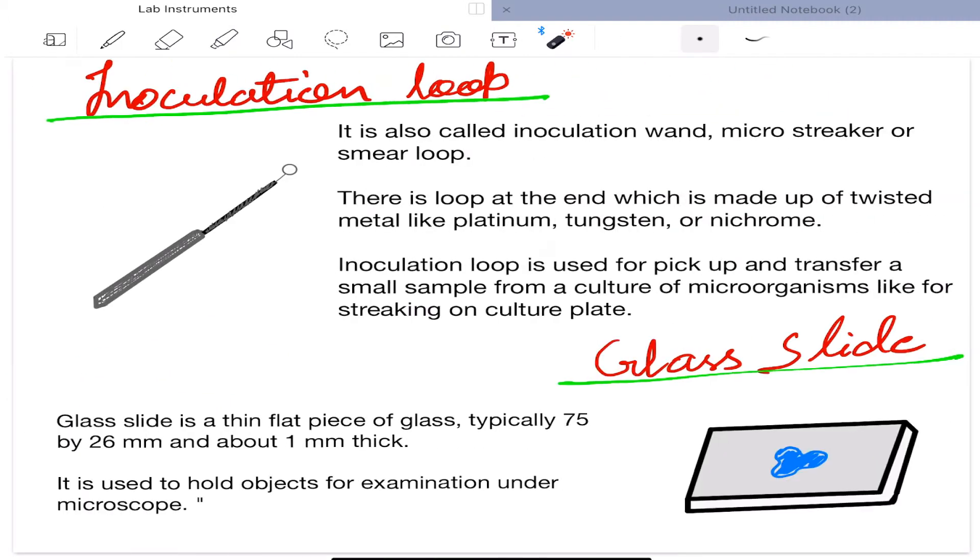Next is inoculation loop. It is also called inoculation wand, microstreaker, or smear loop. There is a loop at the end which is made up of twisted metal like platinum, tungsten, or nichrome. Inoculation loop is used for pickup and transfer of a small sample from a culture of microorganisms like for streaking on culture plate.